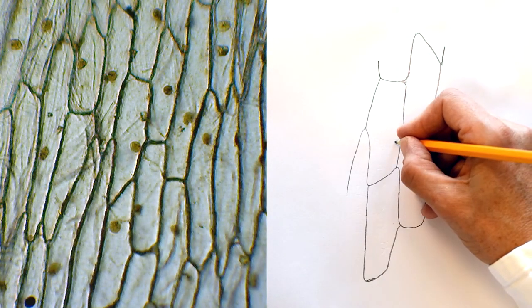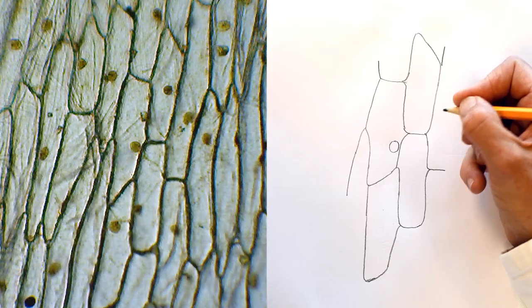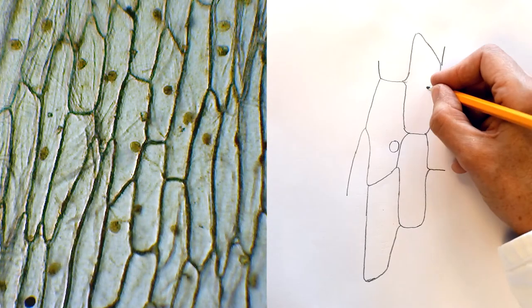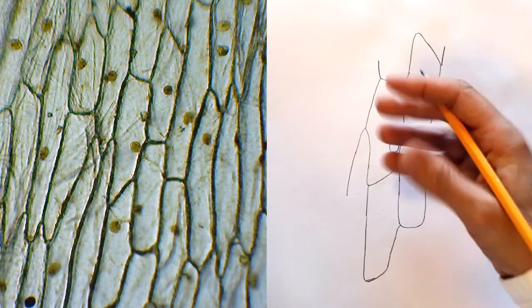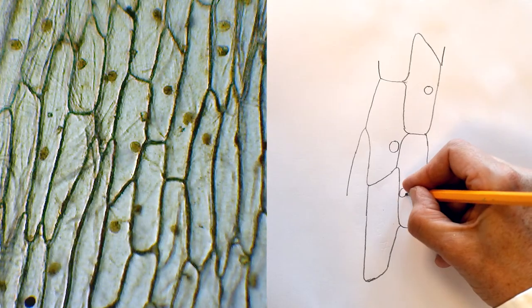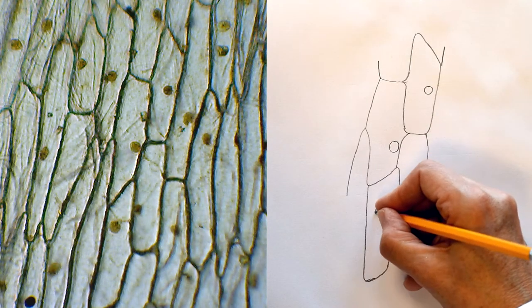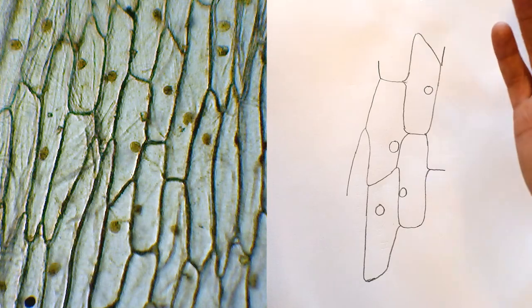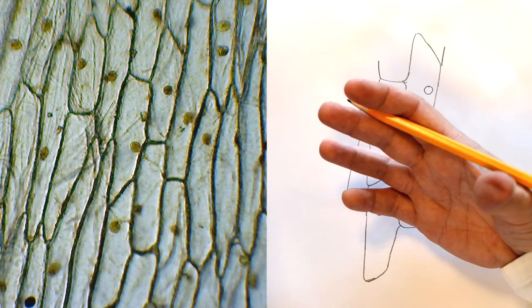Well I can see the location of the nucleuses. So I'm not going to put them in randomly, I'm going to put them in actually where I can see them down the microscope with these cells. Can I see any more detail at this magnification? No. So I'm not going to put any more detail in.